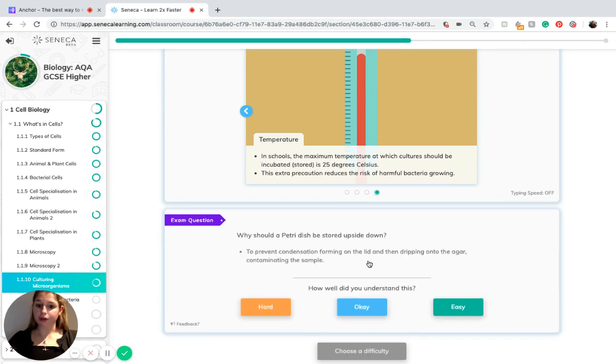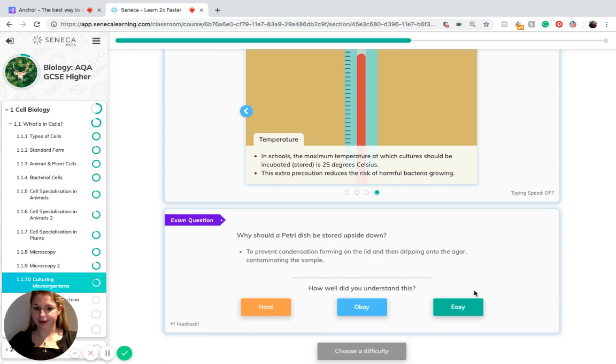Why should a petri dish be stored upside down? This is because we want to prevent condensation forming on the lid and then dripping onto the agar, contaminating the sample.